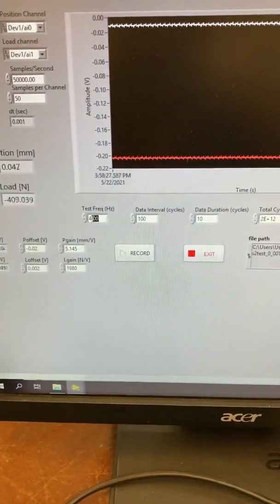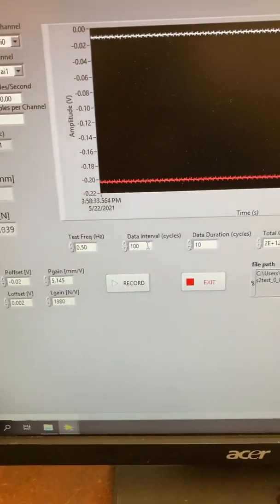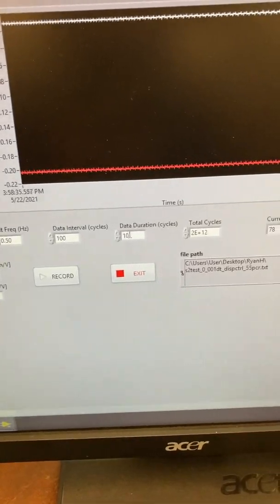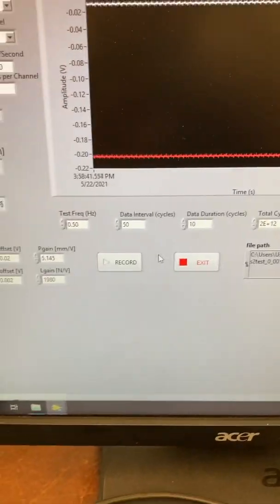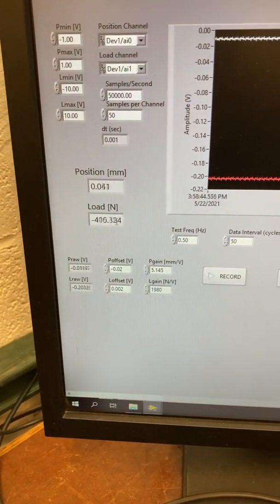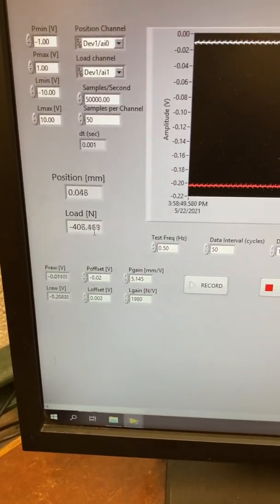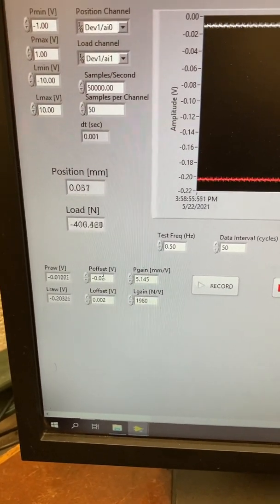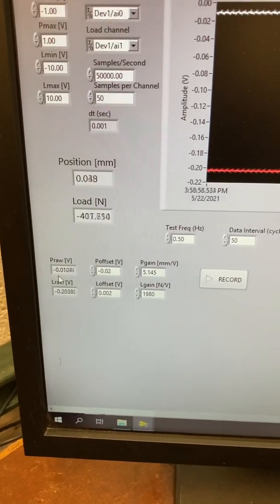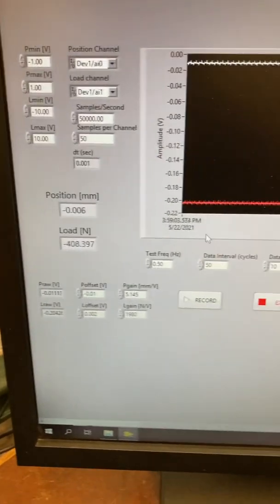We need to come back over here and make sure everything is the same. The test frequency is 0.5 Hz. The data interval means every 100 cycles we take 10 cycles of data — in our case we actually want this to be 50, so every 50 cycles we take 10 cycles of data. What we should have done when it was zeroed was adjust this load offset, but the position we need to adjust — this should be negative 0.01.